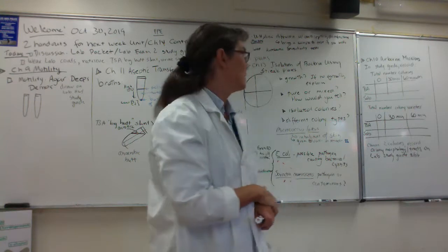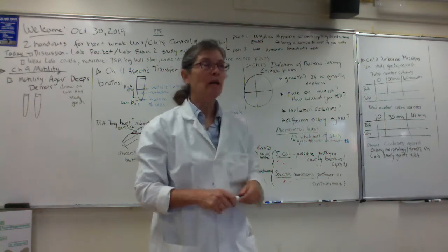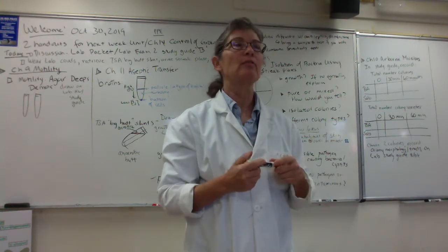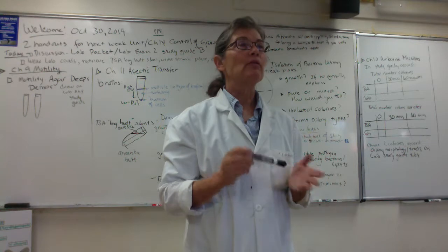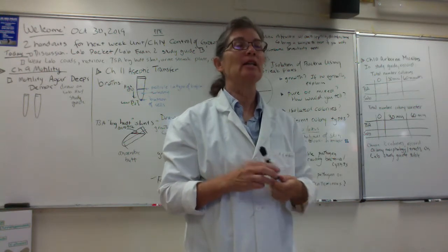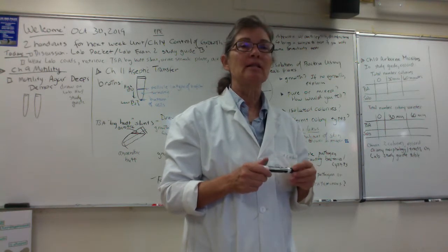called Micrococcus luteus. Micrococcus luteus, these are gram-positive cocci. They often form tetrads, little packets of 4 cells, if we were to gram stain them. And folks, what's really cool about them is at low temperature, they usually make a yellow pigment. So do you have any yellow colonies on your plates?